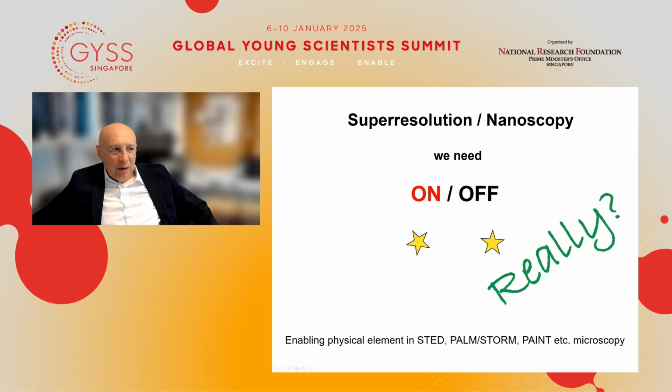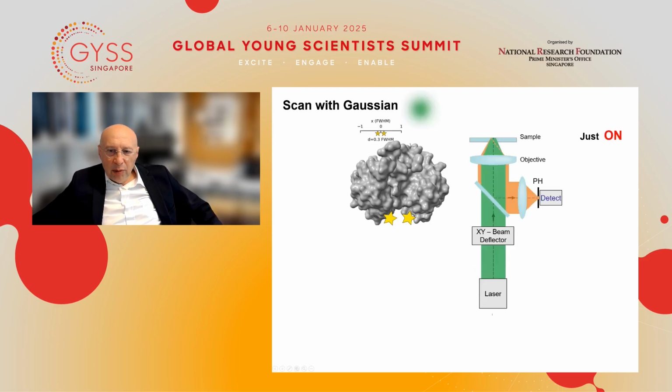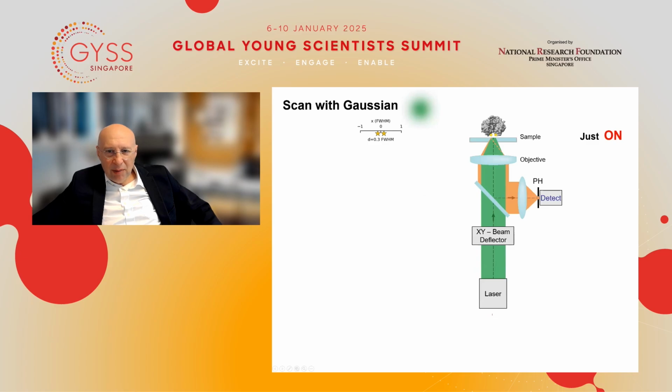So I've been questioning myself, can I beat this fundamental tenet actually of the whole field of super resolution microscopy? If there's a way of beating that, it would be a big step, of course. And we figured out, and I realized that in the end, it's possible. And I would like to explain this to you under certain conditions, that this can be done. This is something very new. It's coming out in a couple of weeks in Nature Physics, but I'm going to revisit, of course, this famous diffraction barrier again.